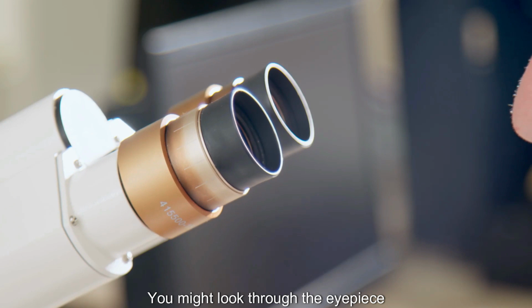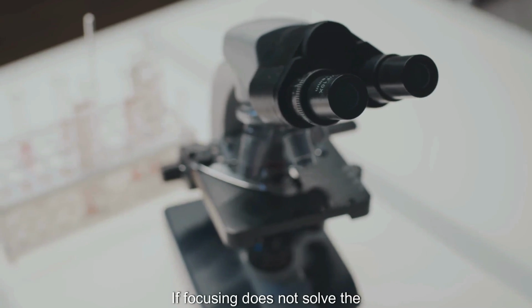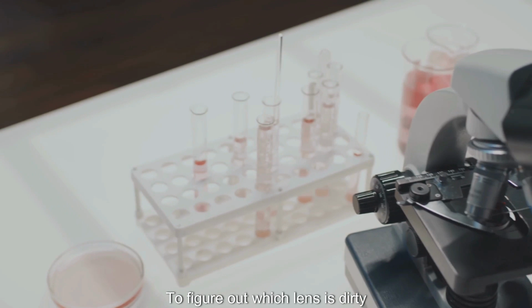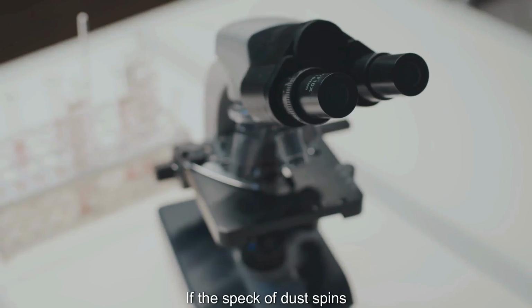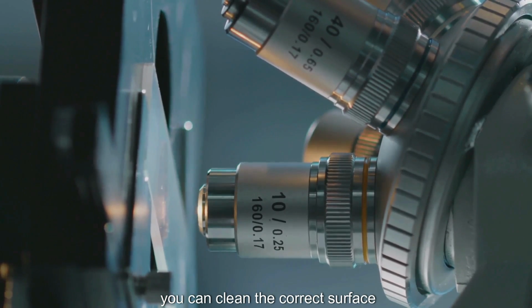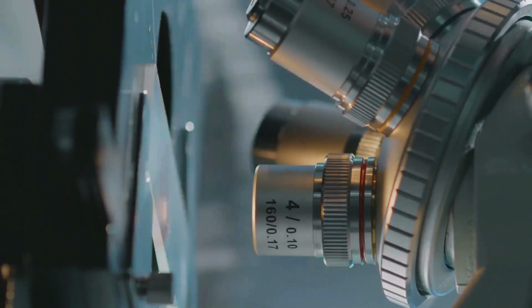You might look through the eyepiece and see only a frustrating blur. If focusing does not solve the problem, the next culprit is almost always dirt. To figure out which lens is dirty, try rotating the eyepiece. If the speck of dust spins, then the dirt is on the eyepiece lens. Once you identify the source, you can clean the correct surface using the gentle techniques we discussed earlier.